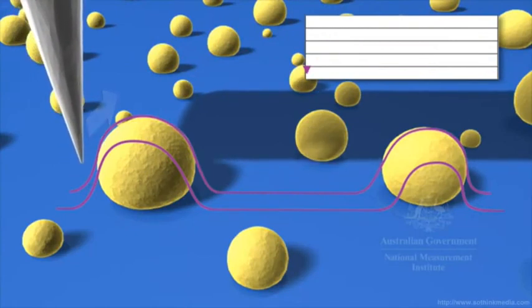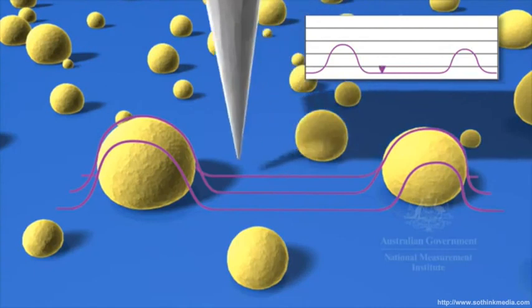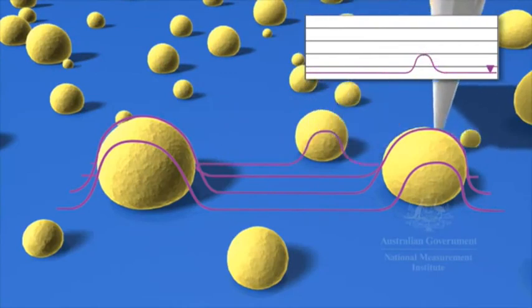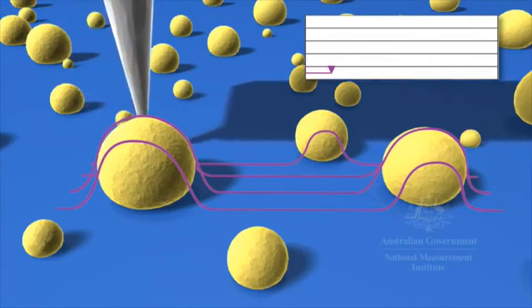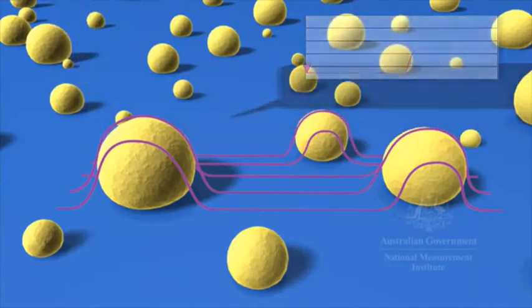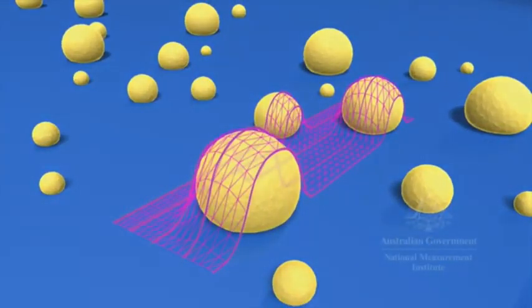The height of the tip is recorded along with the coordinates of its point in the scan. The resulting map of tip position can then be processed to render an image of the sample topography with nanometer resolution.